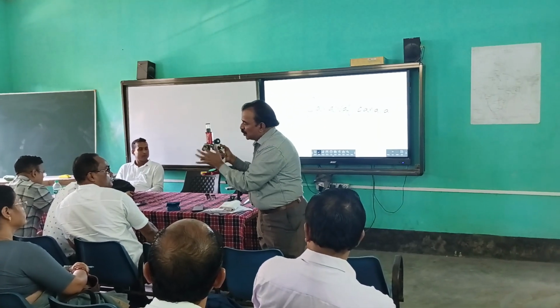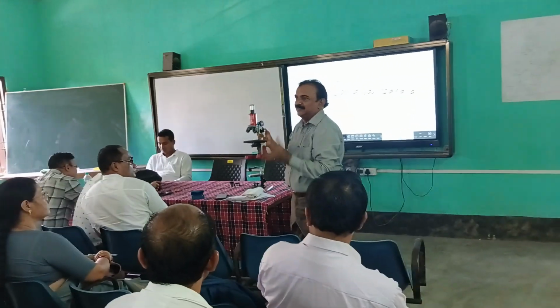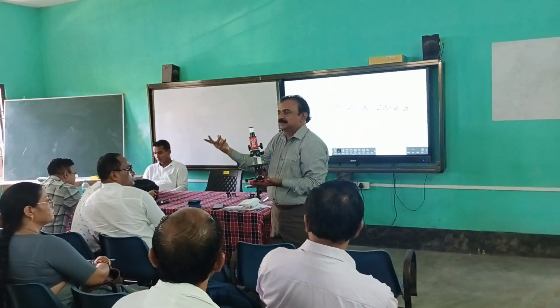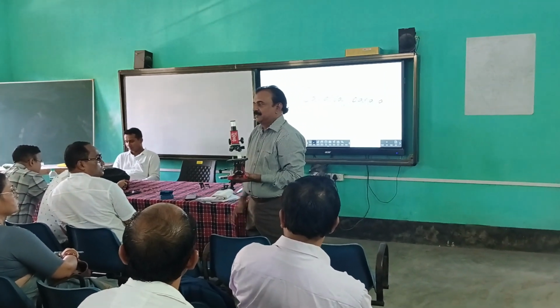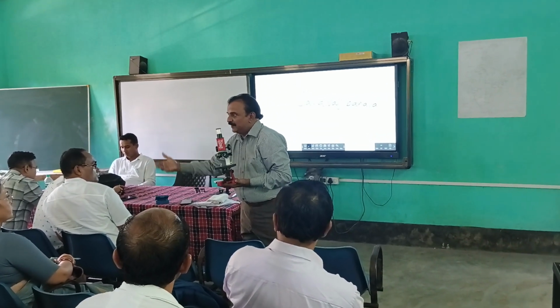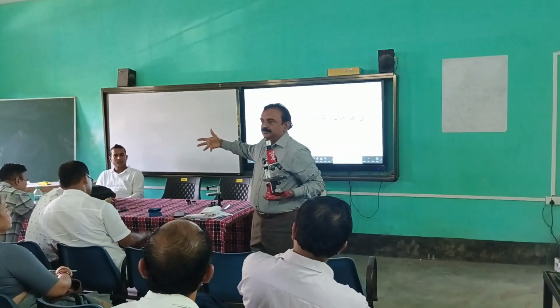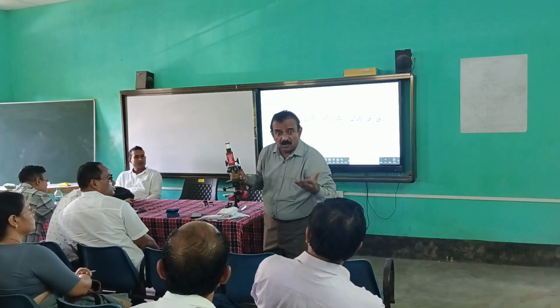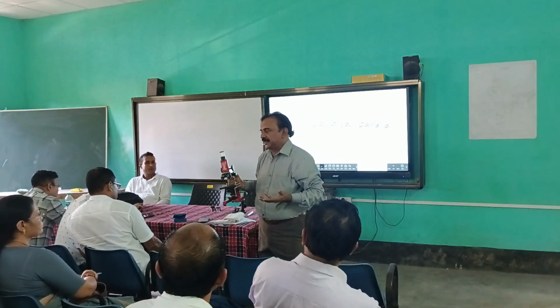There you see two lenses are there. A compound microscope uses two lenses, but a simple microscope uses only one lens. That is the difference between them. So its magnification is more. It magnifies the specimen up to 4,000 times. For example, if I magnify our colleague up to 4,000 times, we cannot see him, because he gets a bigger size. So it is useful to magnify the specimen up to 4,000 times.